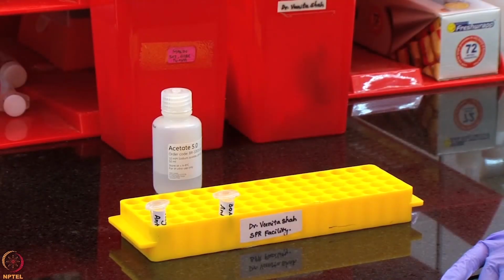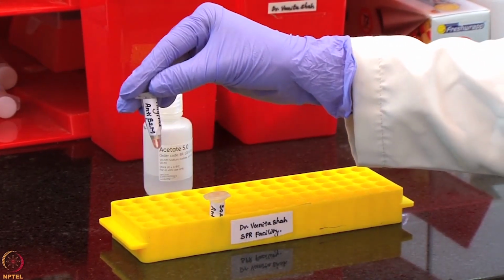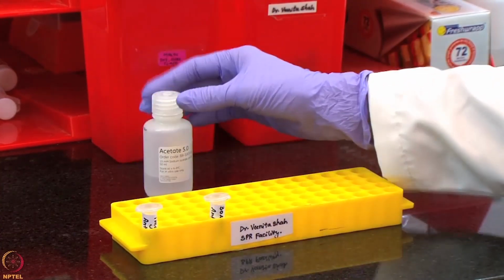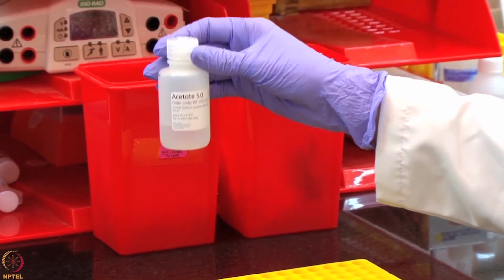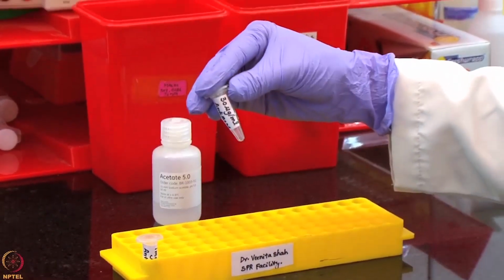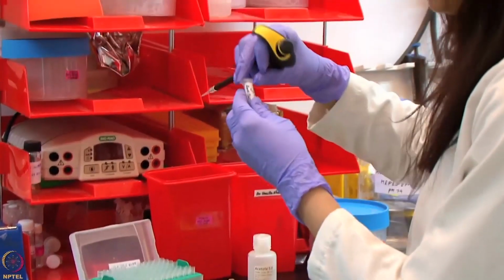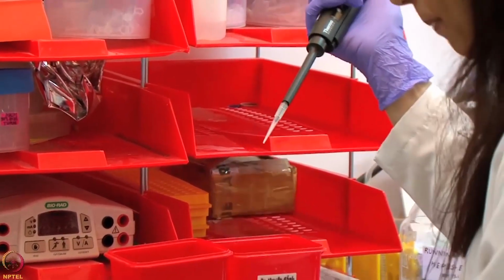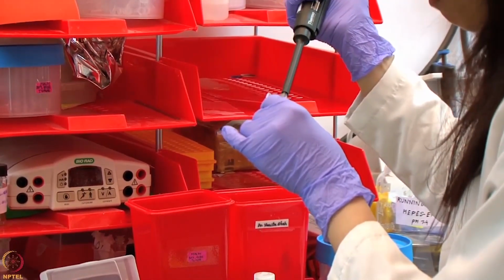We will first dilute the stock concentration of the antibody, which is 1 mg per ml of anti-beta 2 microglobulin in 10 millimolar sodium acetate pH 5 to make a working antibody solution of 30 micrograms per ml. For this, we will take 6 microliter of the ligand stock and mix it with 194 microliter of sodium acetate pH 5.